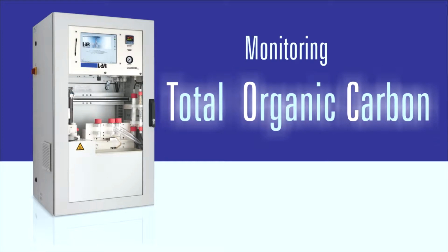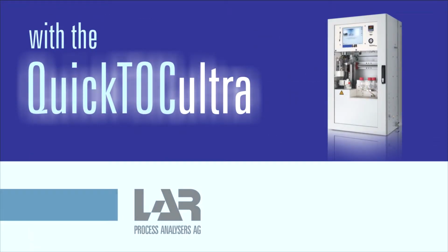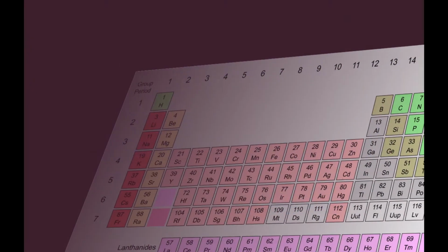Monitoring total organic carbon through high-temperature combustion with the QuickTOCultra, designed and manufactured by LAR and available in the US and Canada through Liquid Analytical Resource, LLC.